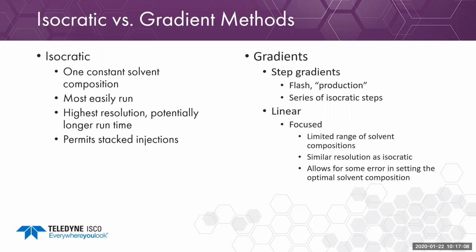This basically changes the retention of your compounds as the solvent strength increases. So this increasing solvent strength allows separation of compounds. It is going to minimize resolution between compounds, so they're going to come out kind of back to back, but it's going to be faster.